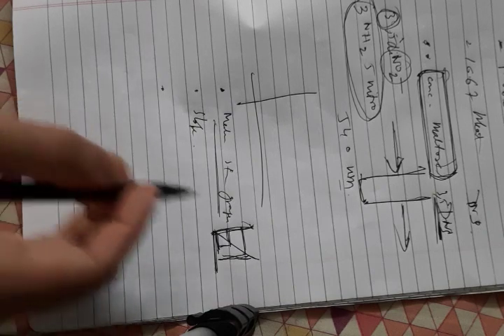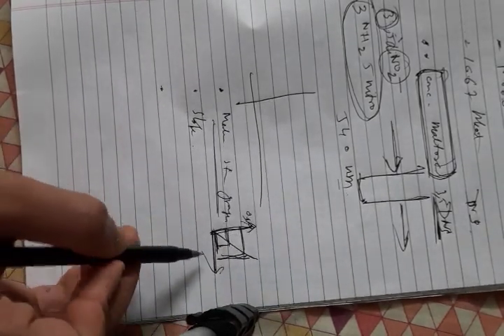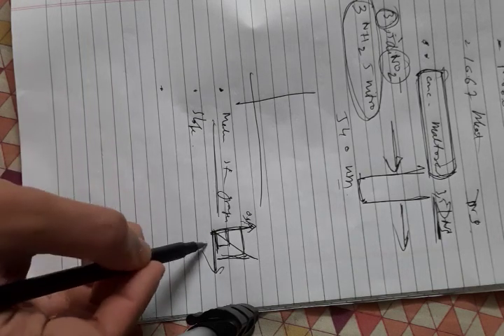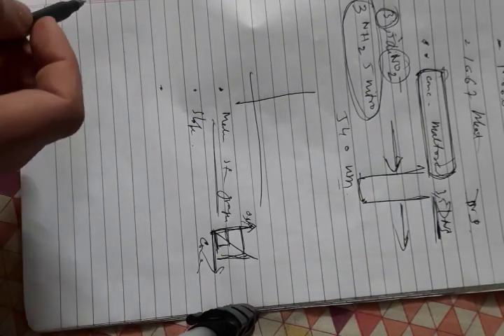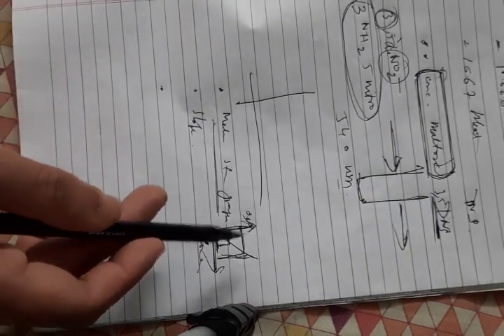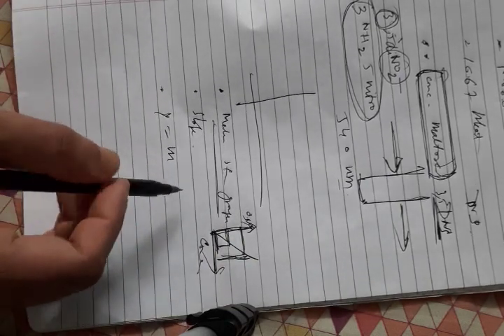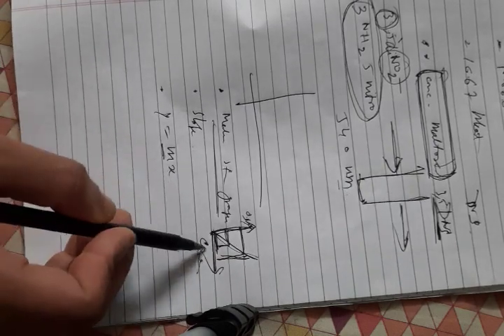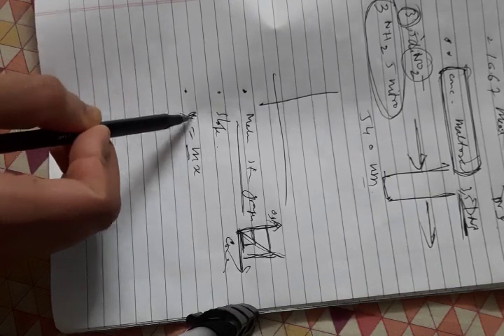And so here, if OD is on this axis and this is the concentration of the maltose, it is like y equals mx, where m is the slope.